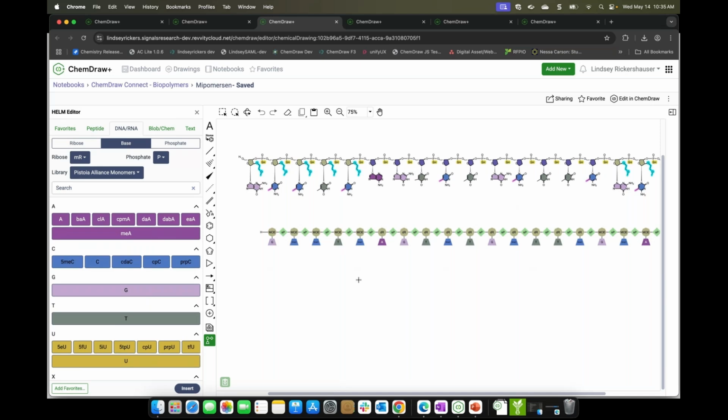You have a ribose, you have a phosphate, and you have a nucleobase that you are using to build this sequence up. And not only that, but you have custom modifications within each one. So what we're going to do is choose here at the top what we're primarily building with. Typically, I wouldn't expect this to change very often, but typically you are going to be building based on the base that you're wanting to use as part of that triplet sort of nucleotide. However, you can choose other residues besides the natural residues for those ribose and those phosphate.